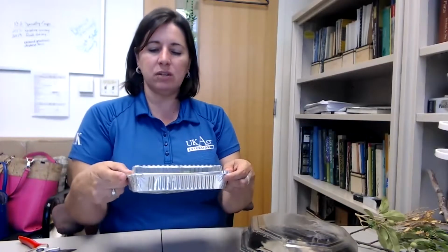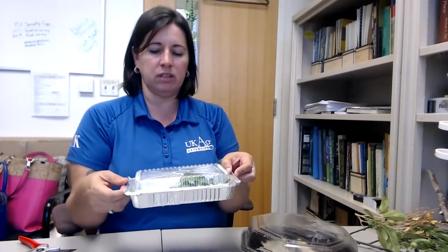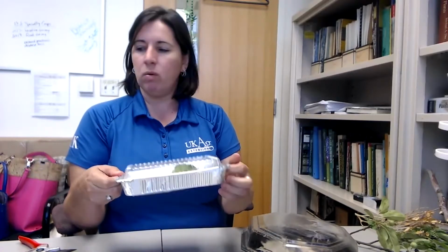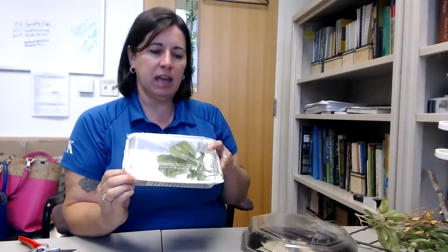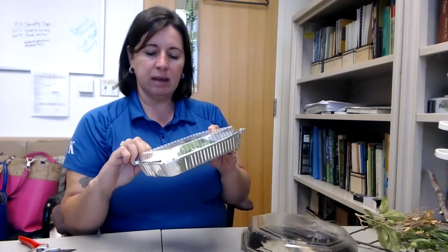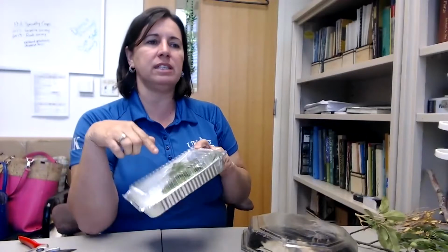Once you have a sealed moist chamber this way, this one you just fold over. It doesn't matter what kind. This is a blue cheese container, which again comes out of my kitchen. In this case you're going to have 98% humidity, and 98% humidity should indeed induce sporulation on anything that you need. There's nothing toxic here, so it's okay to leave it on your desktop. When you come back in the next morning, you can take a look. So moist chambers, absolutely critical.